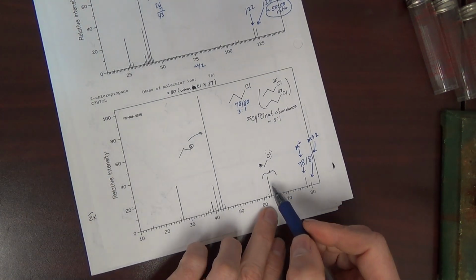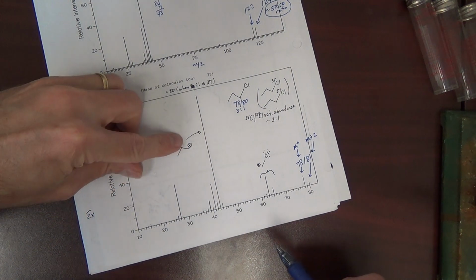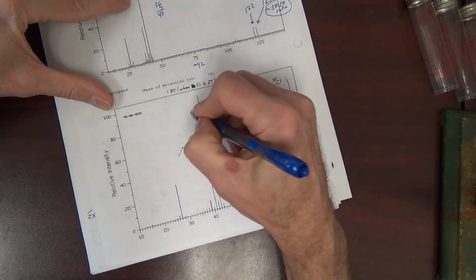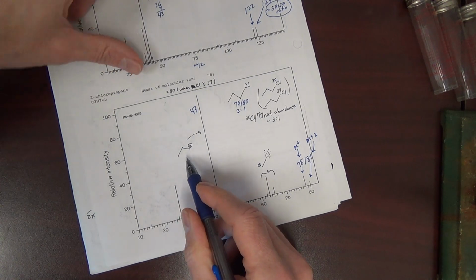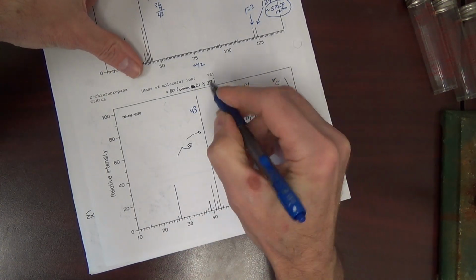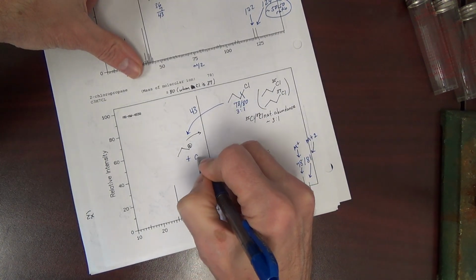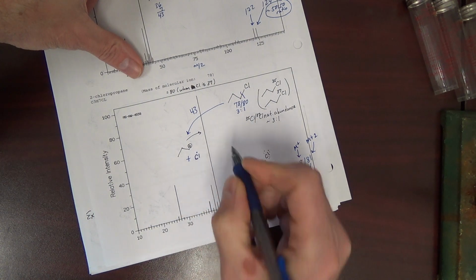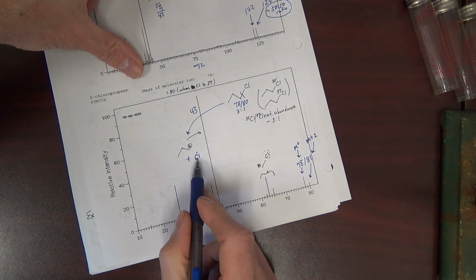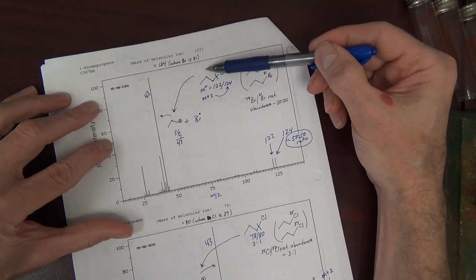Okay, if we look at this compound here, what type of cleavage is going on? First off, the base peak is the same as above, 43, right? Looks like the same cleavage as above. We cleave here, right? We get this plus the chlorine radical. Halogen radicals are very common. That's probably why it cleaved here, as opposed to maybe cleaving just a hydrogen.